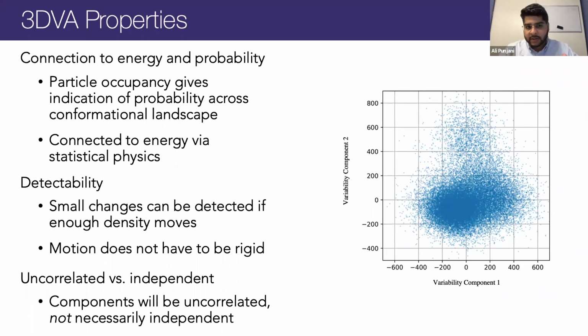However, we're not at the point where we can make that connection in a quantitative manner. And so if anybody's using 3D variability analysis, I wouldn't encourage drawing conclusions in an energy related sense yet.